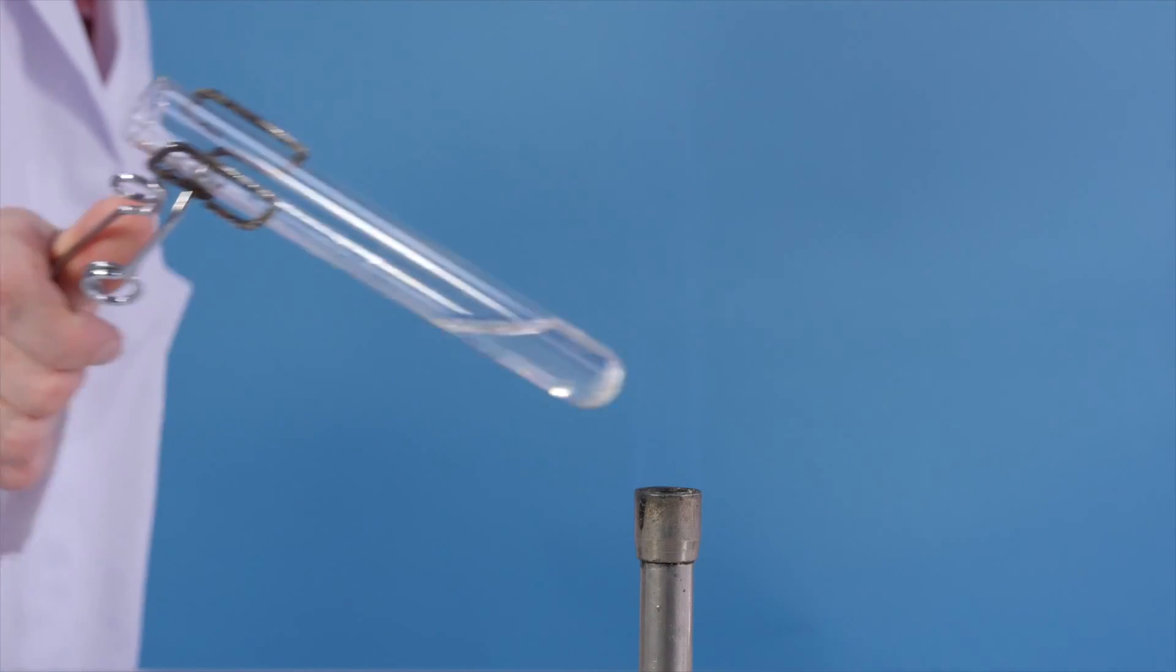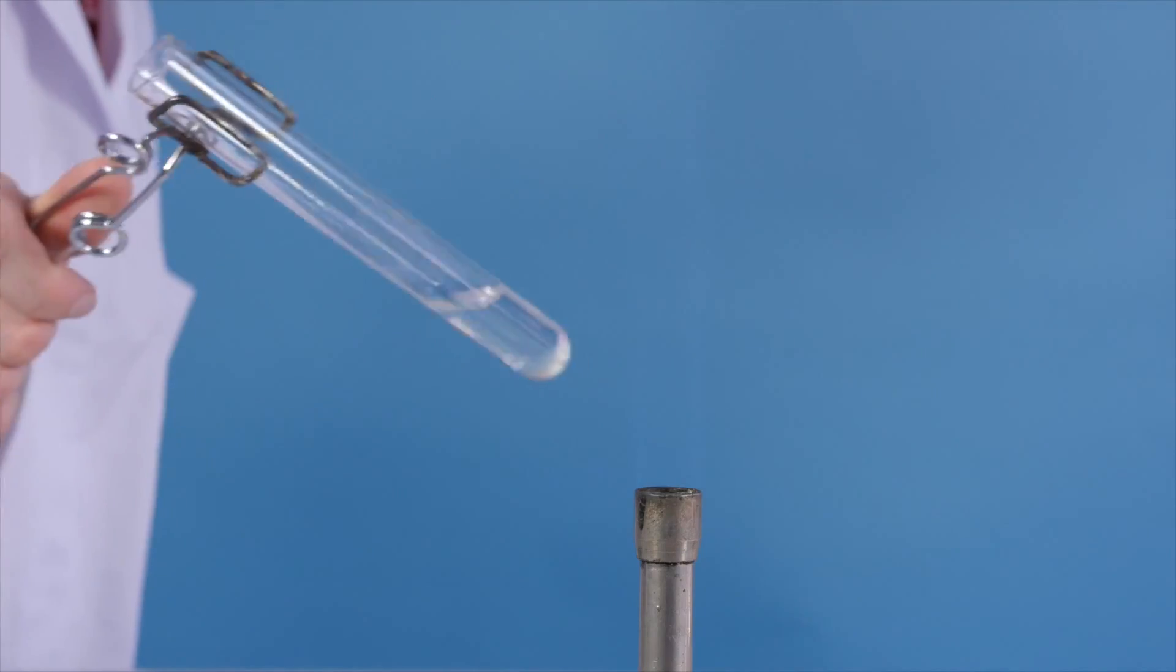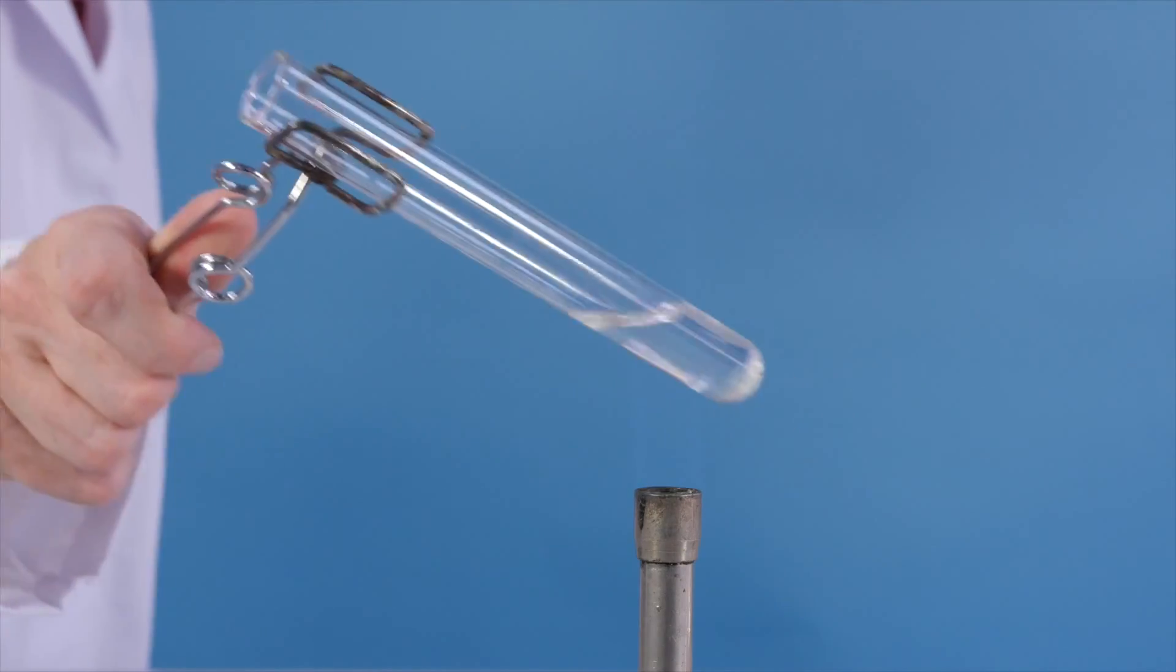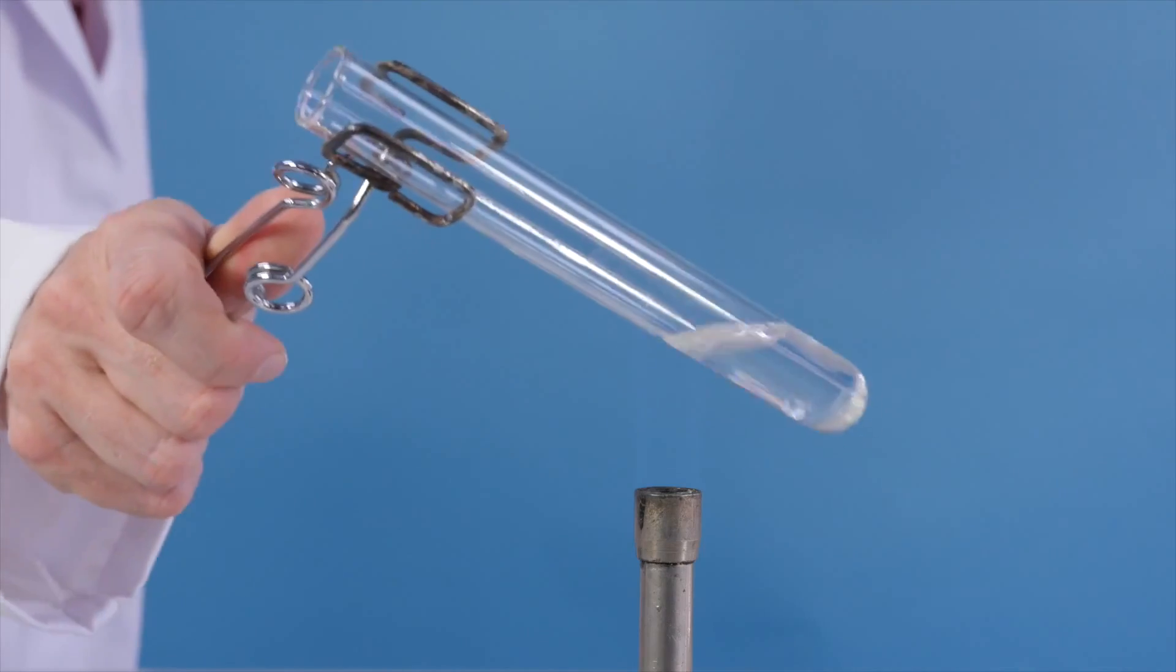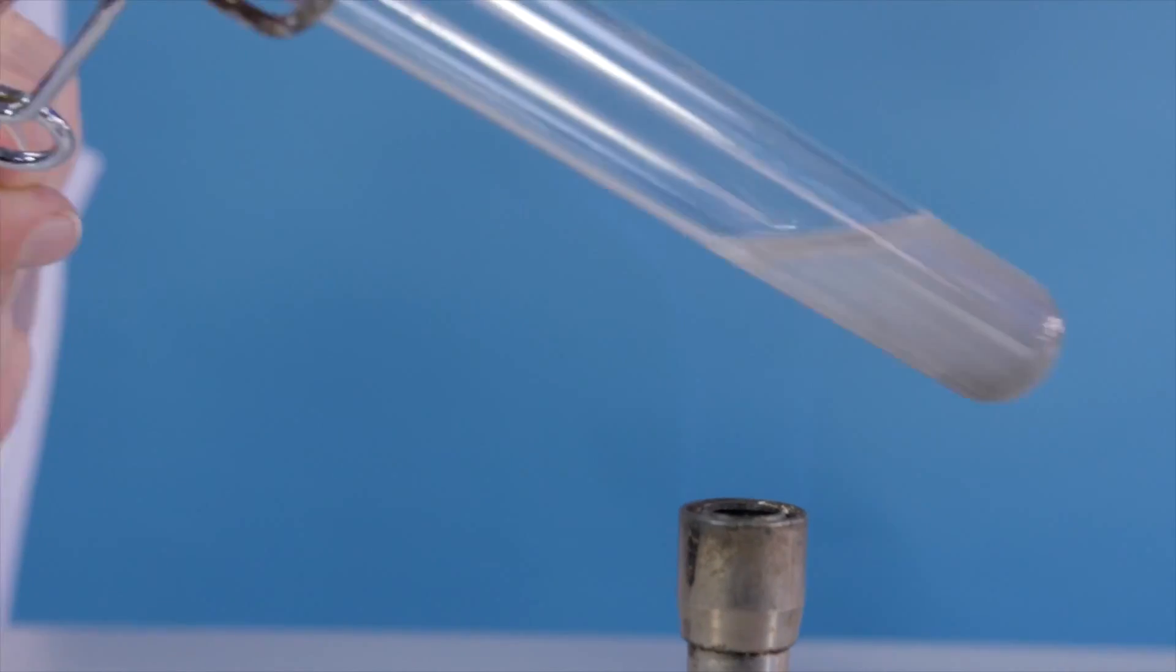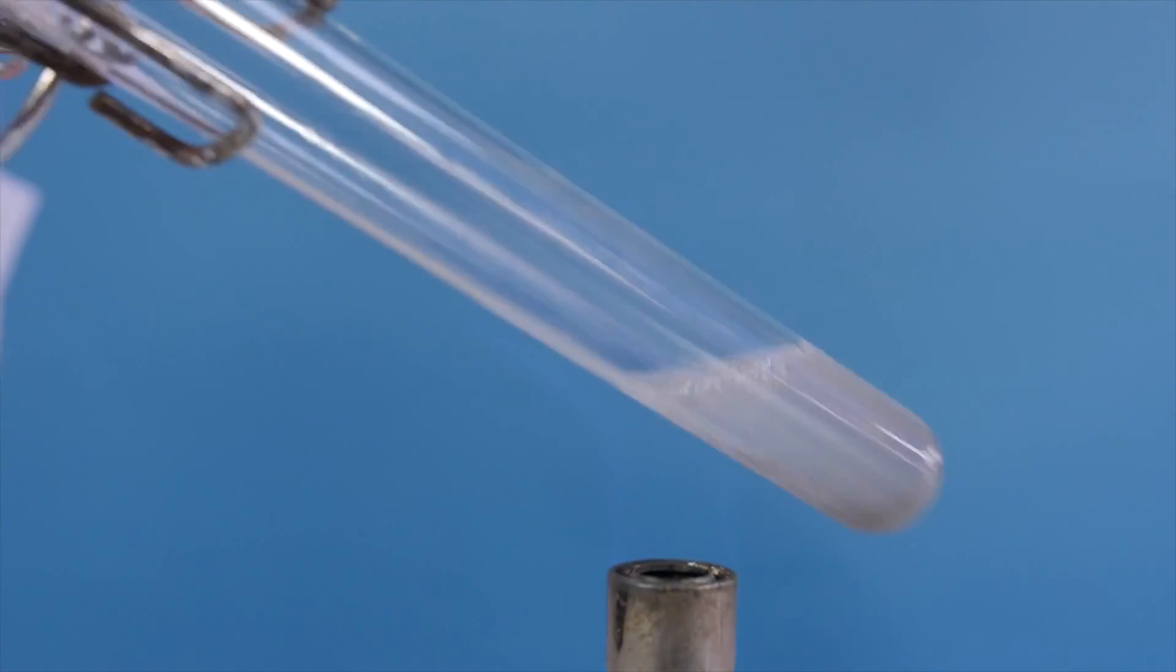Take care to warm the surface of the solution. Be careful as the sudden formation of steam bubbling through the solution can blow the contents of the test tube out. This is known as bumping, which is common with alkaline solutions.